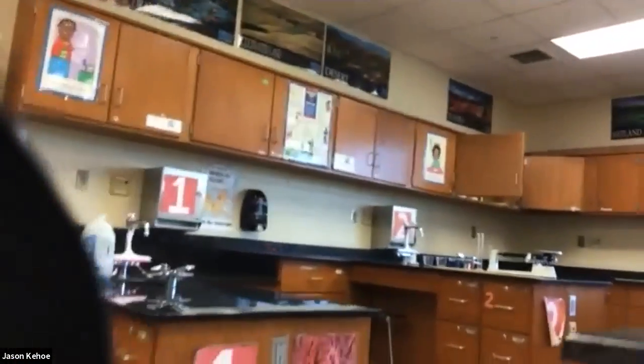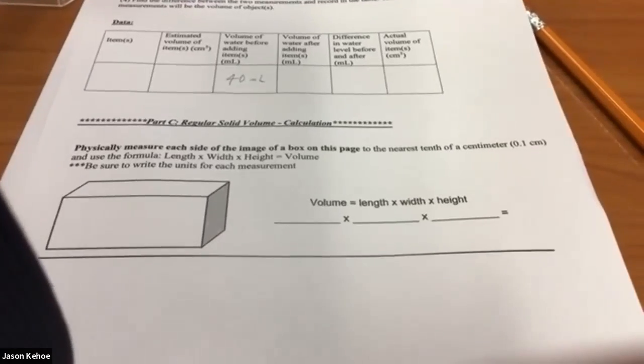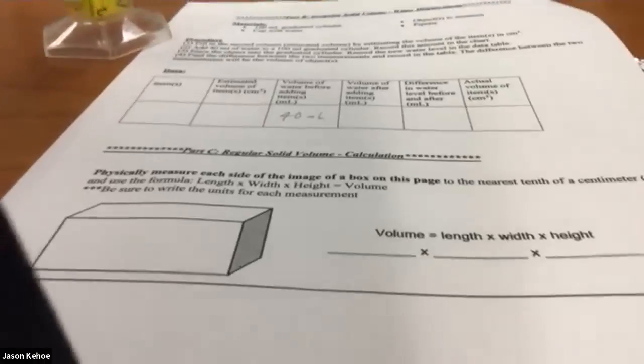For this next bit, I'll need to grab a ruler. Measuring the volume of a regular solid using that length times width times height formula that we saw from our notes. So for this, I'm going to leave you to do. If you have a printer, awesome, you can print out this page.